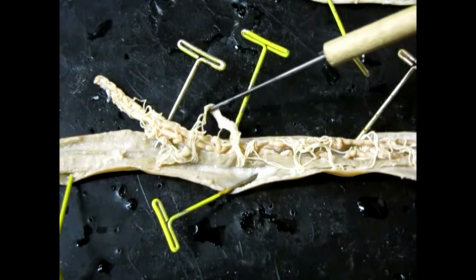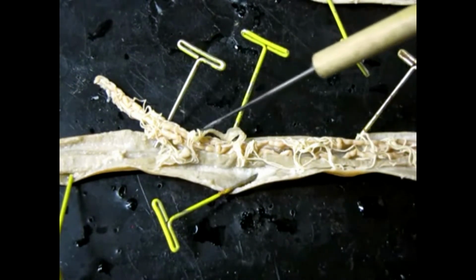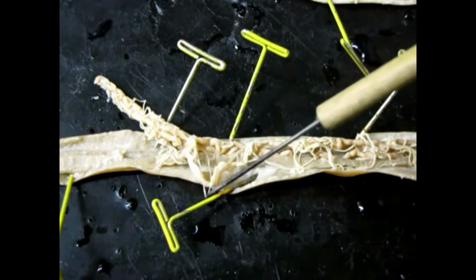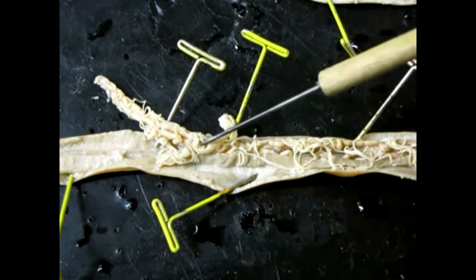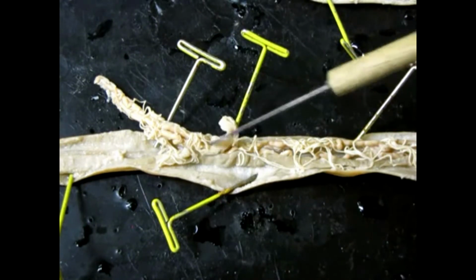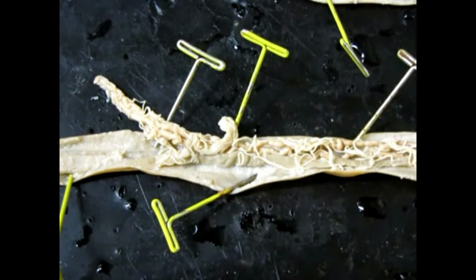That's a big coil of them, and those are the oviducts and the ovaries. So the ovaries are very, very fine, and it can be very hard to discern them, but basically the ovaries obviously are the site where eggs are produced. Those pass through the oviducts into the uterus. Okay, that's where fertilization occurs, and then they're passed externally via the genital pore. Okay, so that's the female.